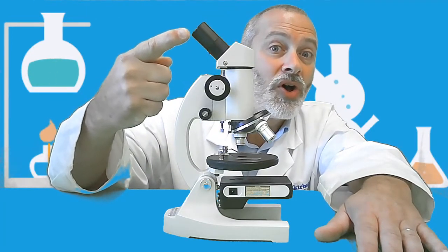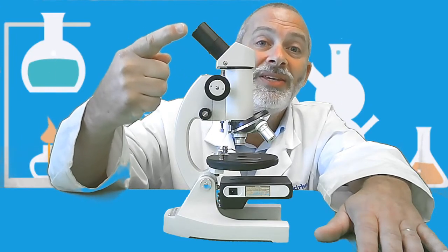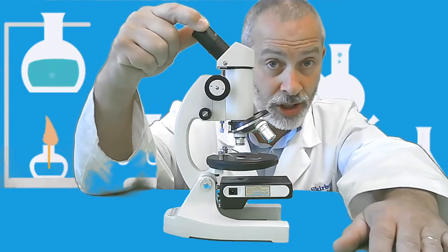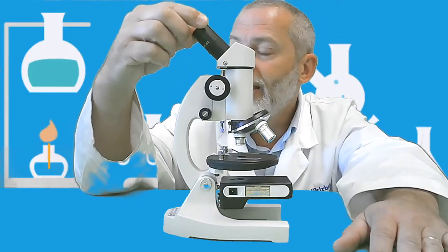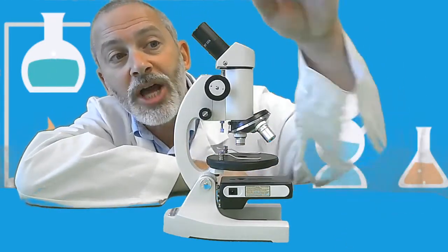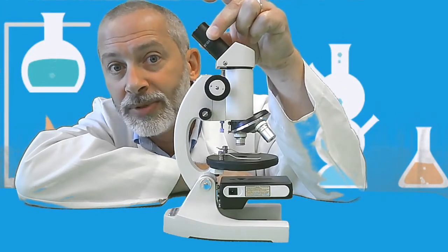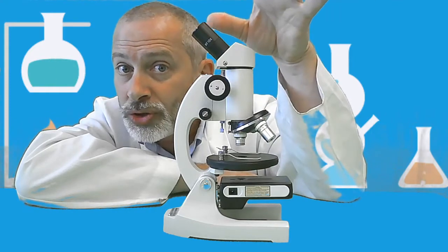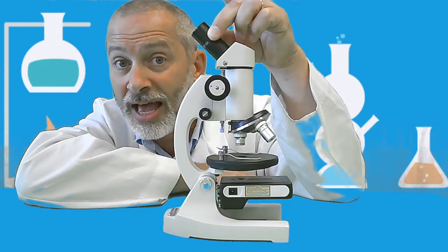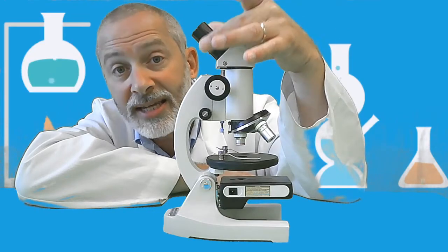Everybody, what is this called? Very good. This is the eyepiece lens, the eyepiece lens. This is the lens that you're going to be looking through with your eyeball. And most microscopes have an eyepiece lens, which have a magnification power of 10 times. Now, that might not mean much to you right now, but it's going to be important for you to remember. In fact, our microscopes in the lab, they're even labeled 10x, which means 10 times.